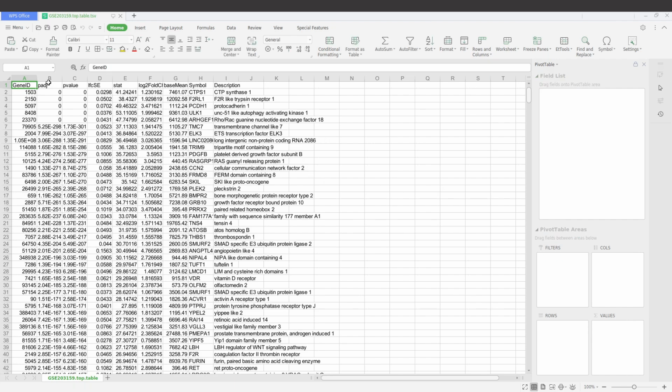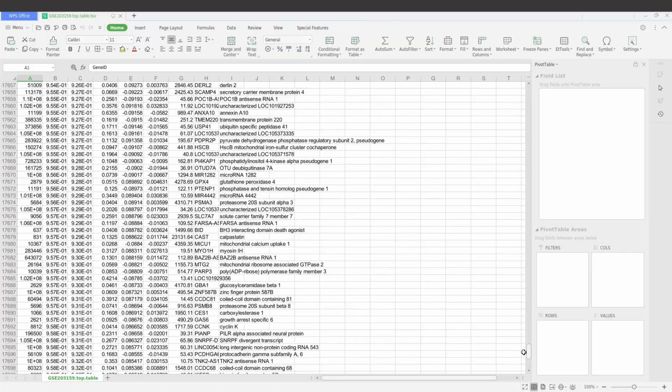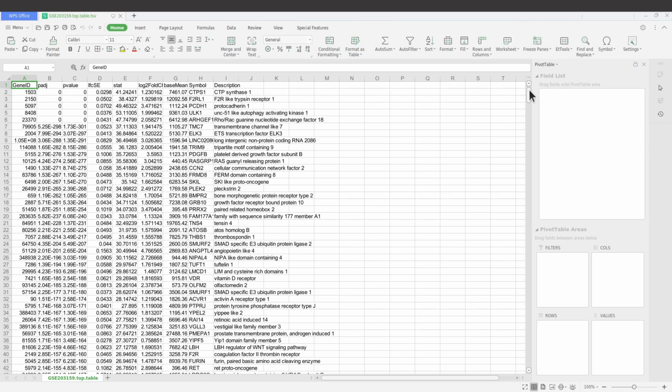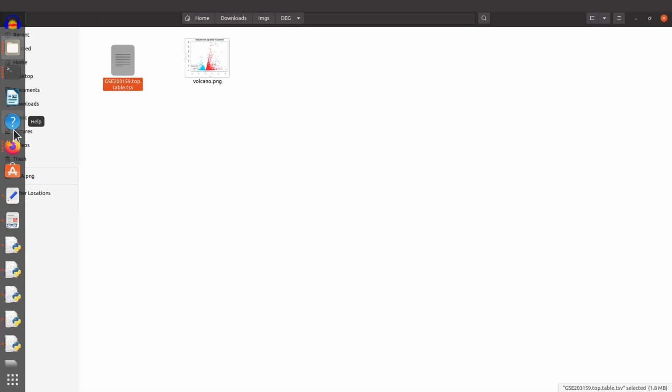So I have all of them here. So we have your gene, log fold change value, P value, etc. So this is the output for DESeq2. All right, so here you have them here. And you can also perform downstream analysis. For example, gene ontology. You can also look at pathway analysis, etc. So these are things that I'm going to cover in other tutorials. Once I'm done with that, you can check the description box. You'll find links to those videos. All right, so that's how we do it. So we can close it and get back to our browser.